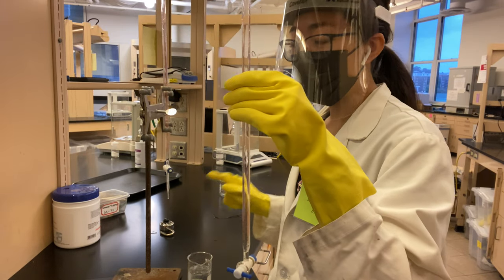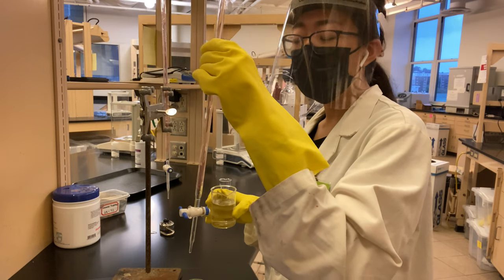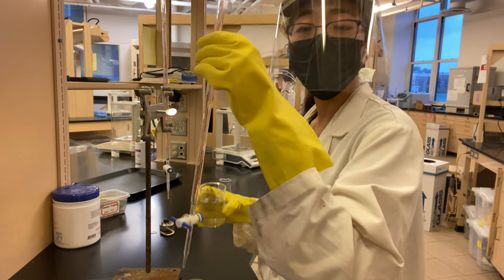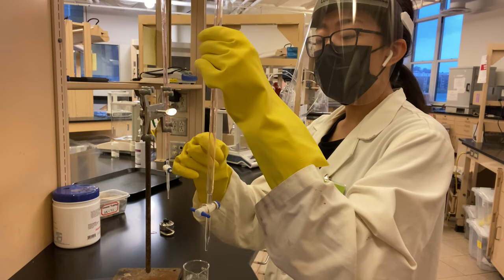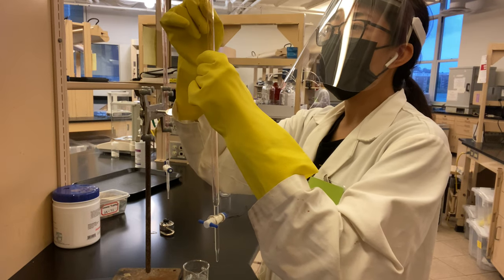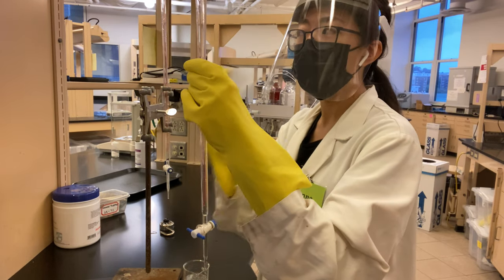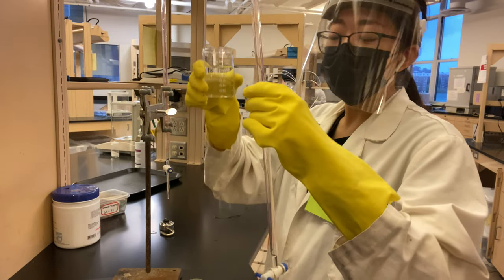In this case, our titrant is water. And so we're trying to essentially rinse out the excess water that's in here with the stuff that's actually in our solution. But like I said, in this case, it's just water still.